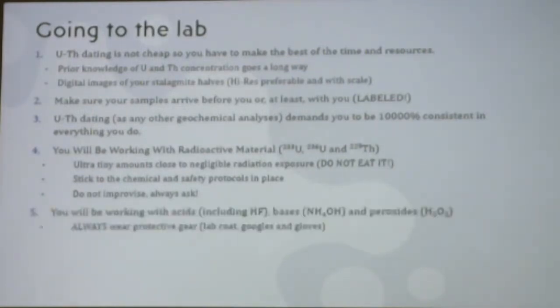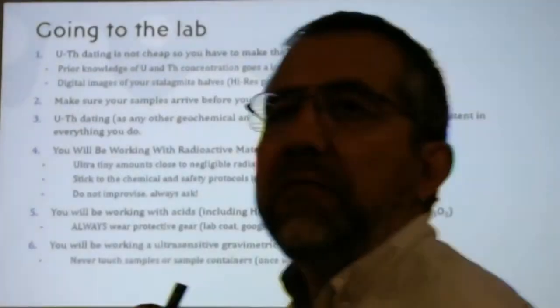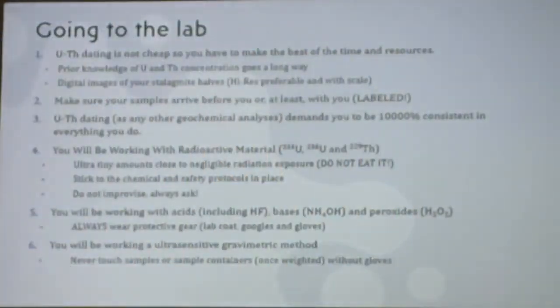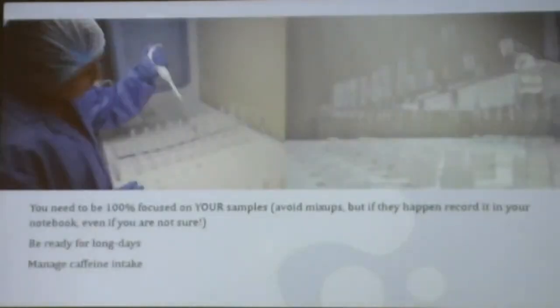You will also be working with acids, bases, and peroxides. Always wear your protective clothes. You will be working with an ultra-sensitive gravimetric method, isotope dilution. So never, ever, ever touch your sample without gloves. Ever. Write everything, label everything. That's very, very basic, very important.